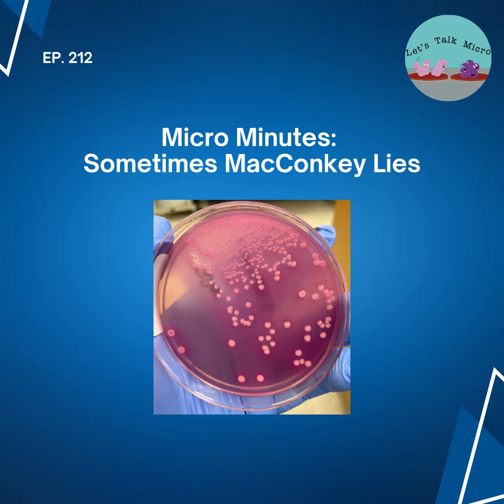So let's talk about MacConkey agar real quick. MacConkey is selective and differential. It is selective for gram-negative rods. I know that you see literature out there that says selective for enterics, or selective for gram-negatives, but the more appropriate term is selective for gram-negative rods, because gram-negative cocci are not going to grow on MacConkey.